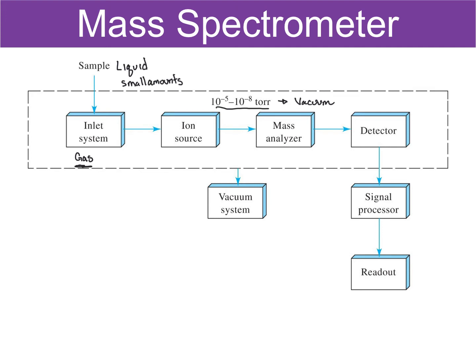Once we get our sample into the mass spec as a gas, it proceeds into what's called the ion source. And so now we're going to take this gas, these are neutrally charged. In the ion source, we're going to make our gas molecules positively charged.